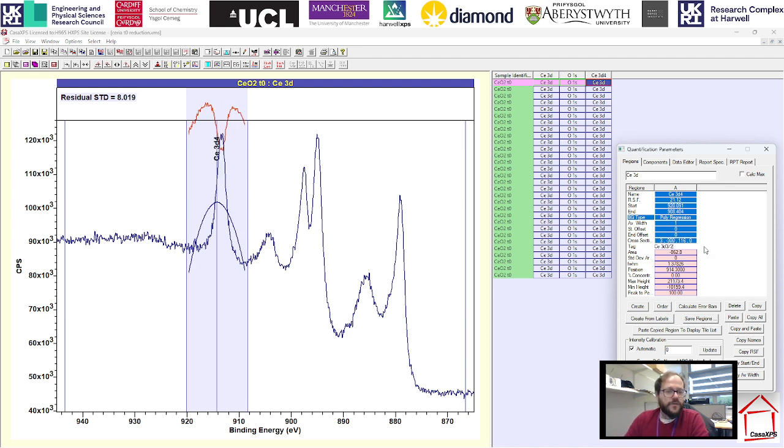So for example, we can go very simple, or we can go a very high factor polynomial, which means essentially we're just drawing through the data, which is all we really want. We just want to put an envelope through this data the same way we would with a component. For this it's nice and easy because you've only got a single peak to look at. If you're starting to look at some more complex things where putting in components and relying on an envelope might involve a lot of variables and maybe not be the most accurate, then a polynomial regression is really handy at just finding your absolute peak maxima. So that's what we've stuck in, polynomial regression, around this peak here.